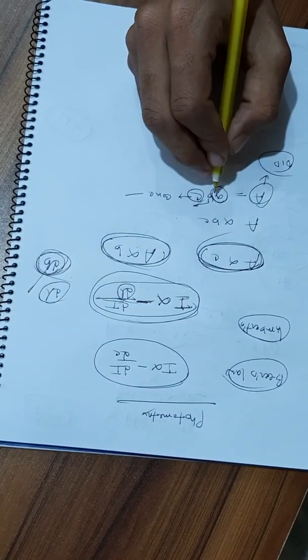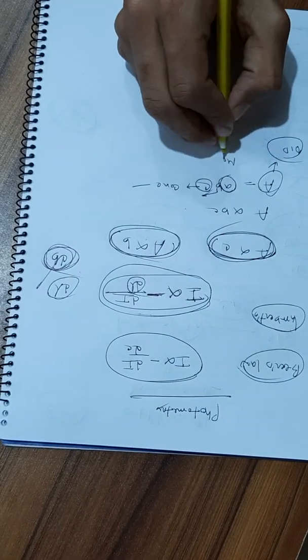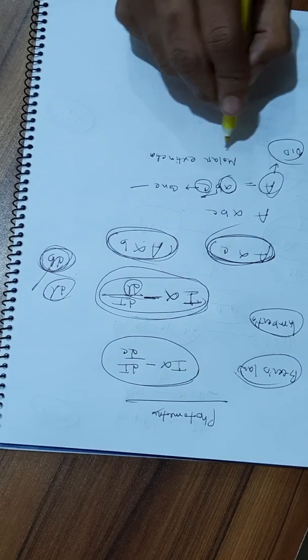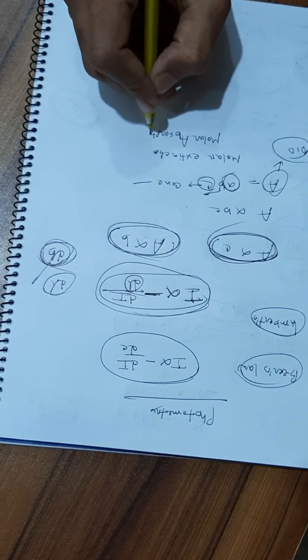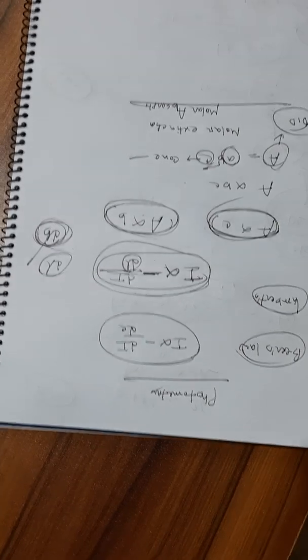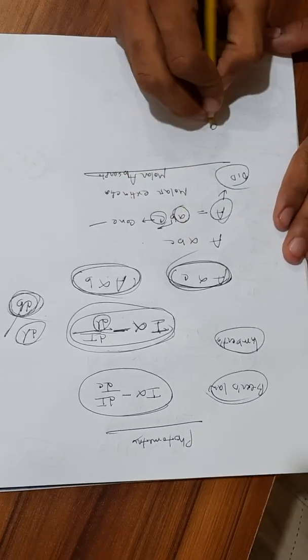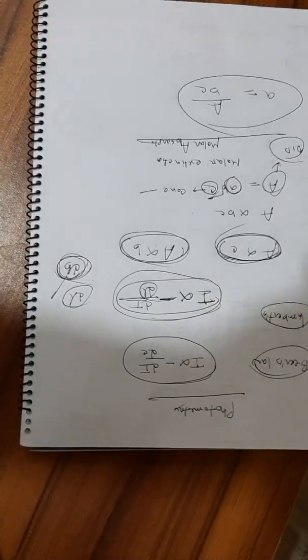Epsilon is said to be the molar extinction coefficient or proportional constant or molar absorbivity. So from Beer's law we can say absorbance is proportional to the concentration, and from Lambert's law we can say absorbance is proportional to the length or depth of the solution or light pathway. So here A equal to εBC. A equal to εBC.